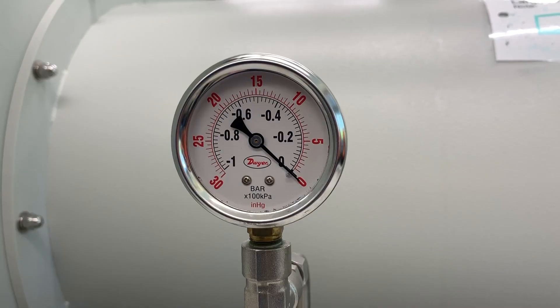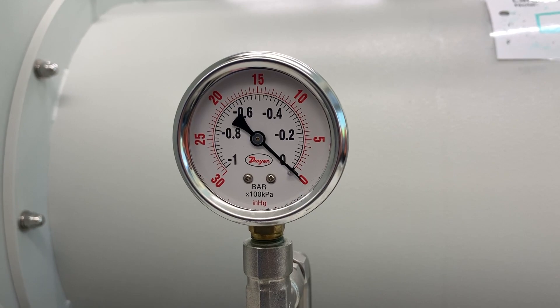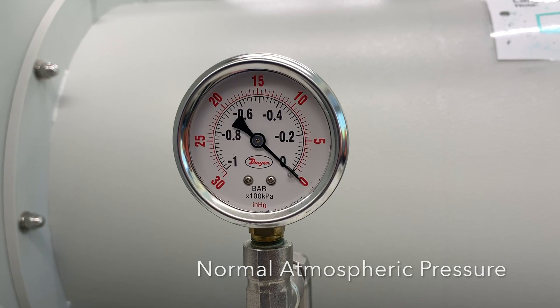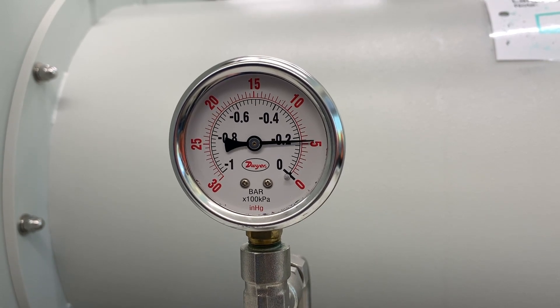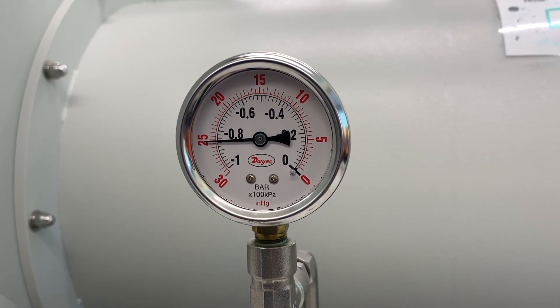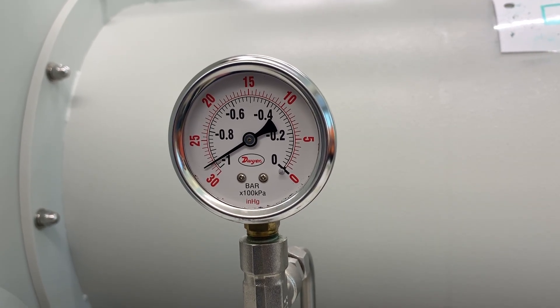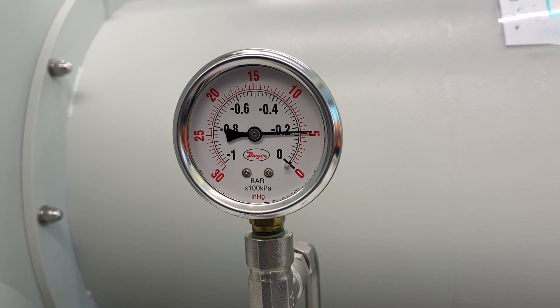The vacuum gauge uses a black needle to indicate the level of vacuum. The far right side is the zero position, which means there's no vacuum present — in other words, it's at normal atmospheric pressure. As vacuum is introduced, the needle moves counterclockwise, eventually coming to rest just shy of 30 inches of mercury on the red scale. When gas is allowed back into the antechamber, the gauge moves clockwise towards zero.